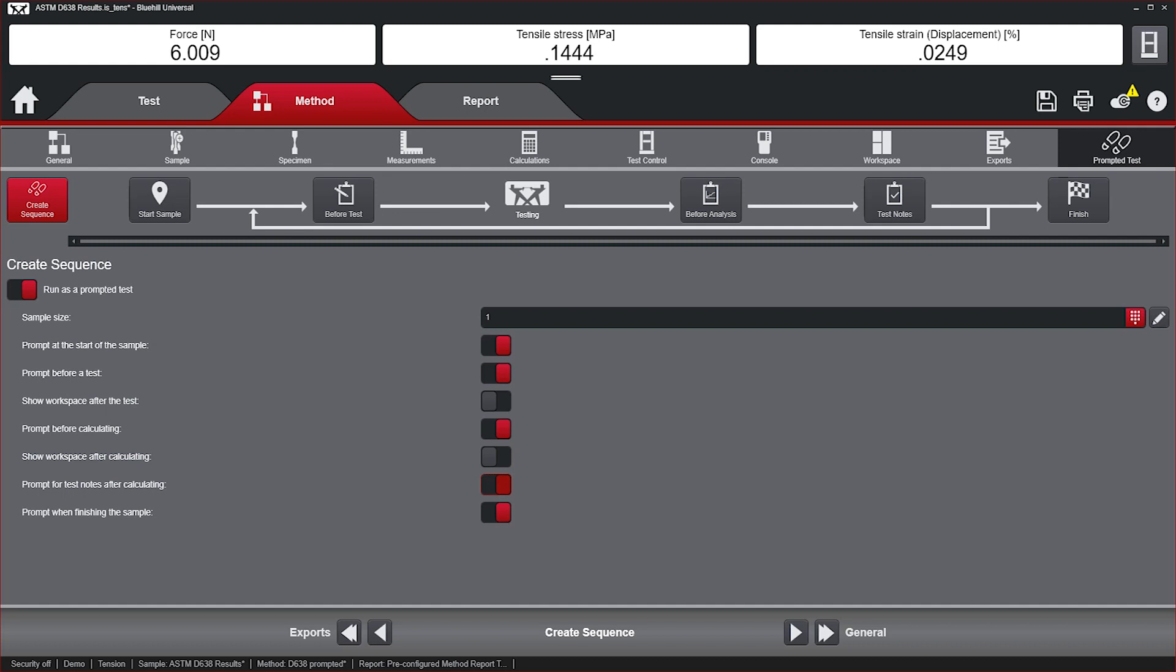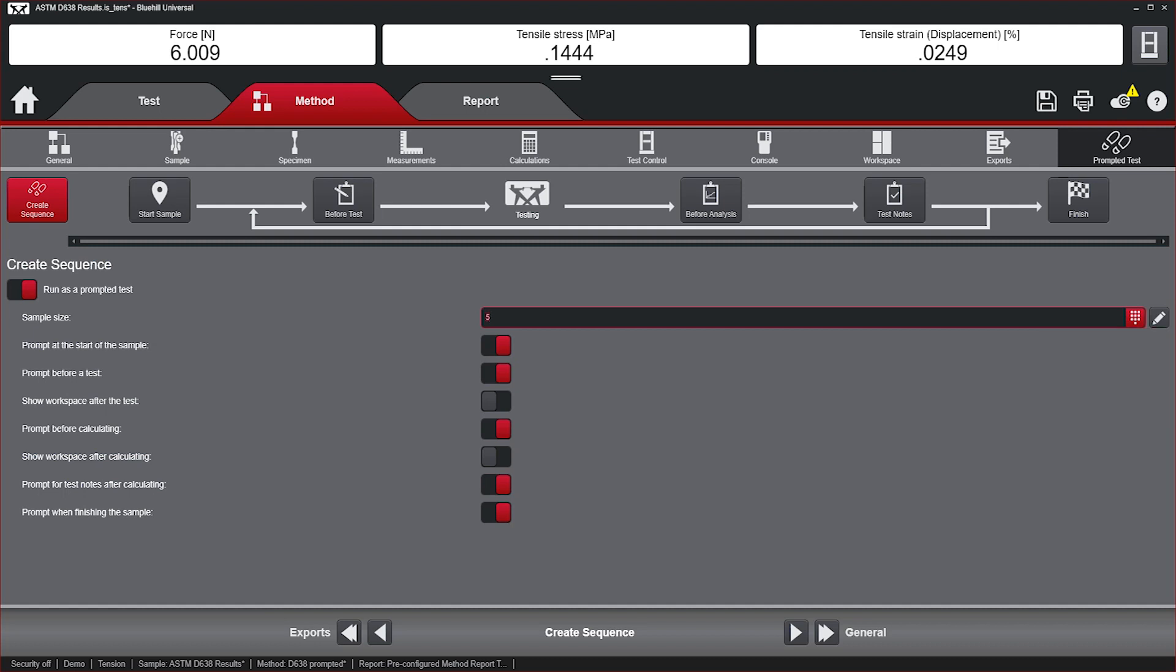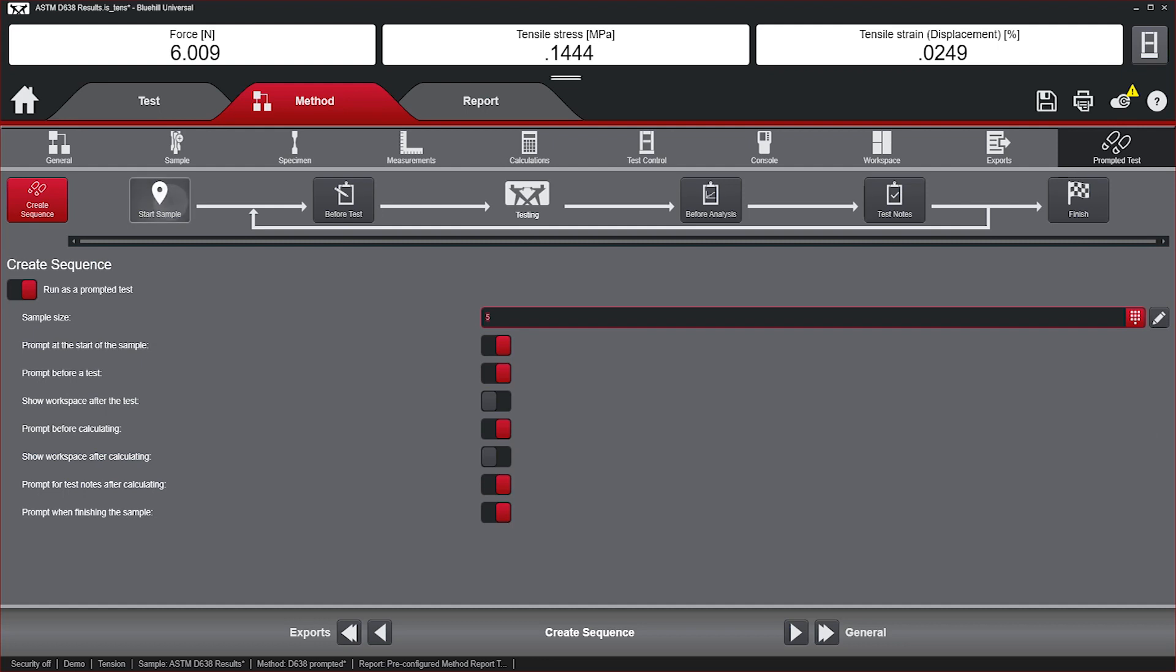Create a Sequence – here you would define parameters such as required number of specimens to be tested and the necessary steps in the workflow. Start Sample – this is where the operator would enter information before starting a new sample, such as lot number or lab conditions.